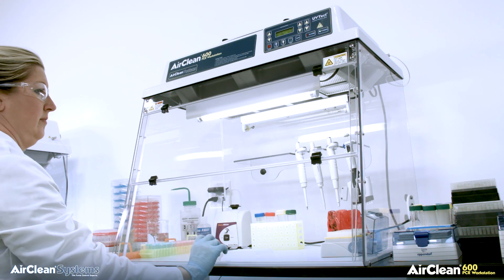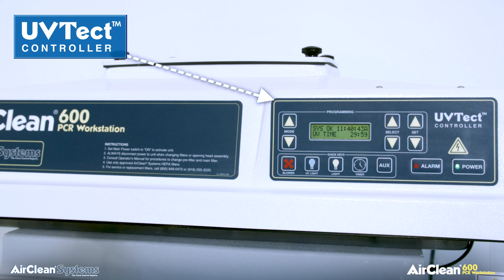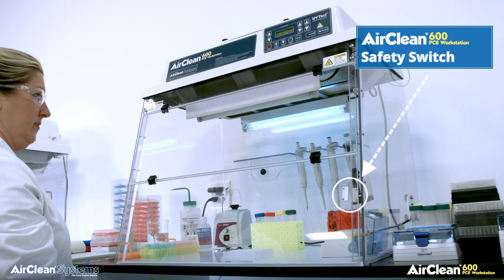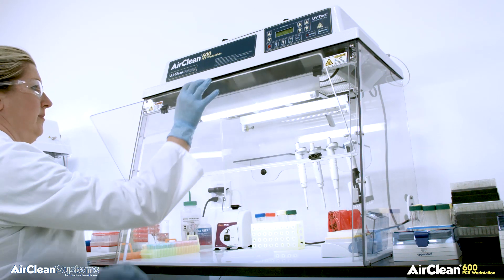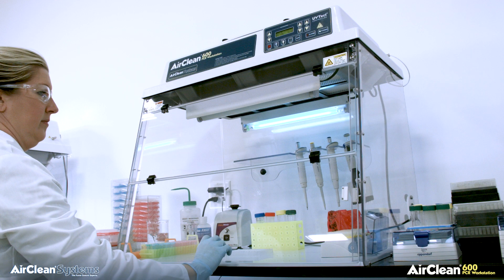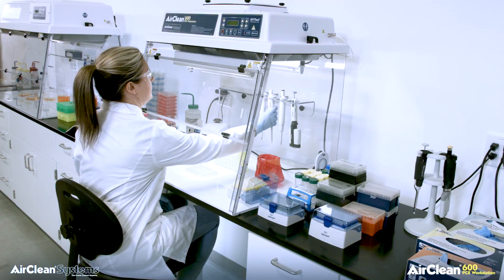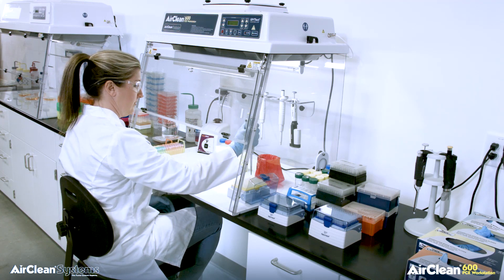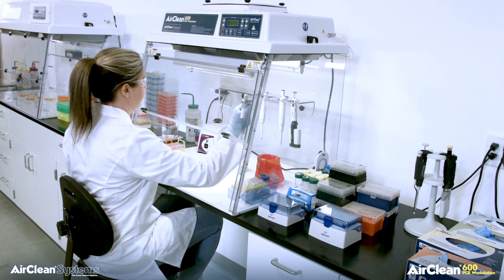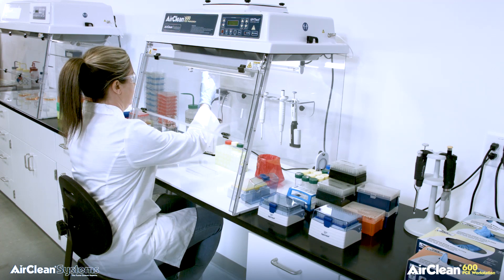During irradiation, the front sash must be fully closed for the UV lamp to be activated. Incorporated into the UV-TECT microprocessor is a safety switch that links the microprocessor to the lower front sash. If the front sash is fully closed, then the UV lamp is activated. If the front sash is opened during the irradiation period, UV-TECT automatically turns the UV lamp off and suspends the timer. This safety feature protects the user from potential exposure to harmful UV energy.